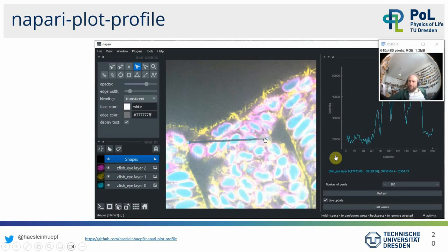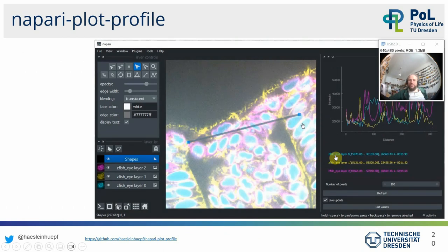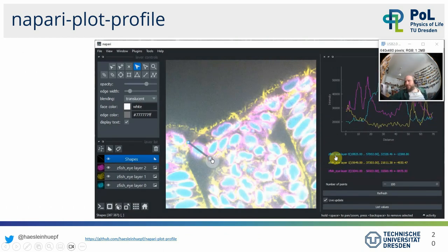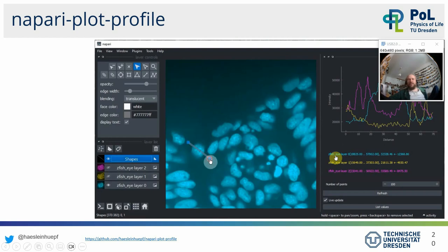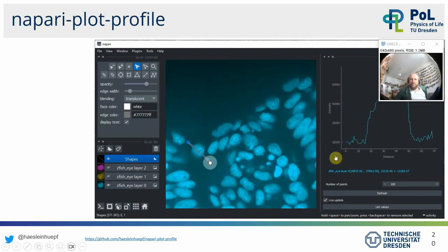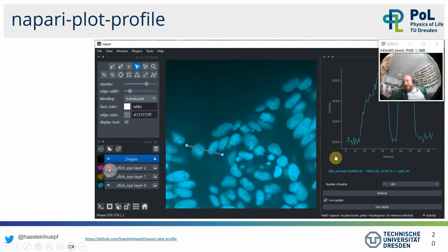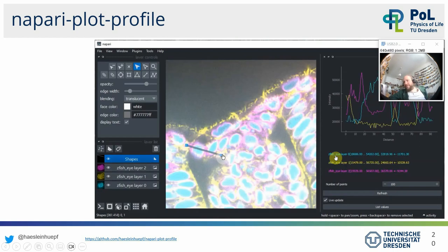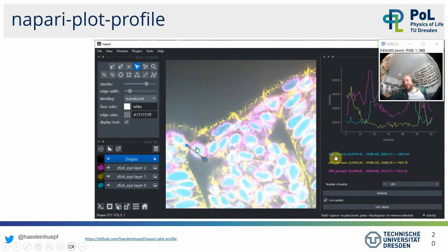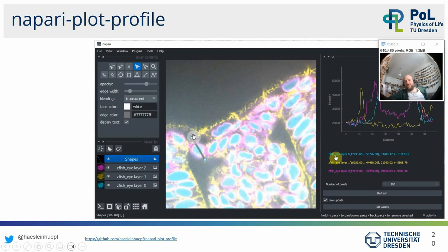For exploring image data, there's also Napari Plot Profile — similar to the plot profiles tool known from ImageJ. You draw a line on a shapes layer (not a labels layer), and it plots the intensity along this line depending on which channels are currently shown. This is useful for seeing how channels are related and how intensities are distributed.